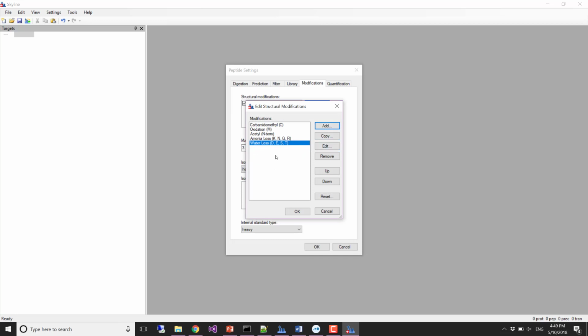So you should now have a list that looks like this. Anybody need more time? Raise your hand if you need more time. Oh, we need more time. You must have changed something. Cancel and start again. Because those defaults, if you leave them alone, they'll go right in like the way they did here.